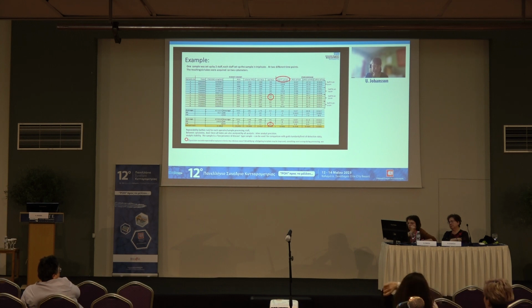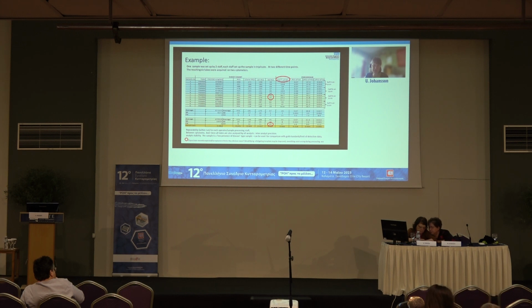And I can see here that one of the CVs is actually over 20. And if you recall, we ideally, for low numbers, want to have a CV of at or below 20. So these are definitely higher than 10, except for that one, but at least usually below 20.